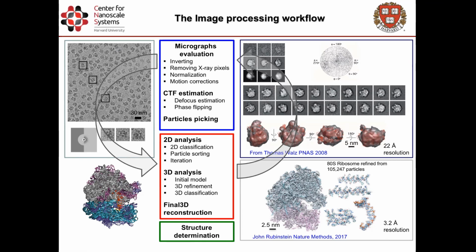A standard classic image processing workflow starts first with the image evaluation, inverting, removing X-ray pixels, normalization, motion correction.